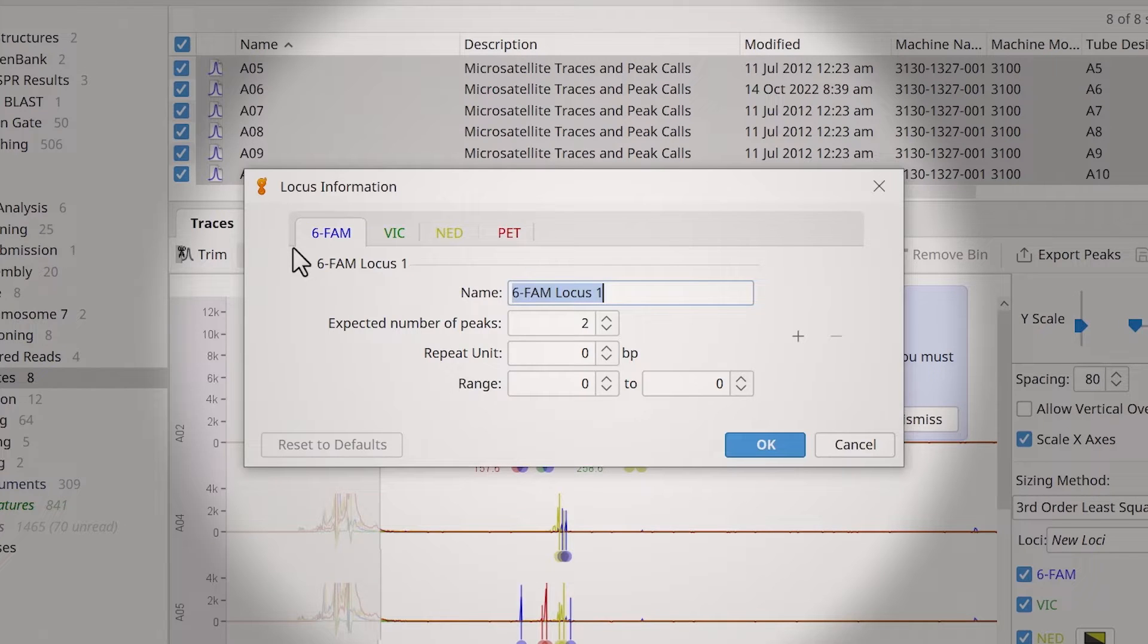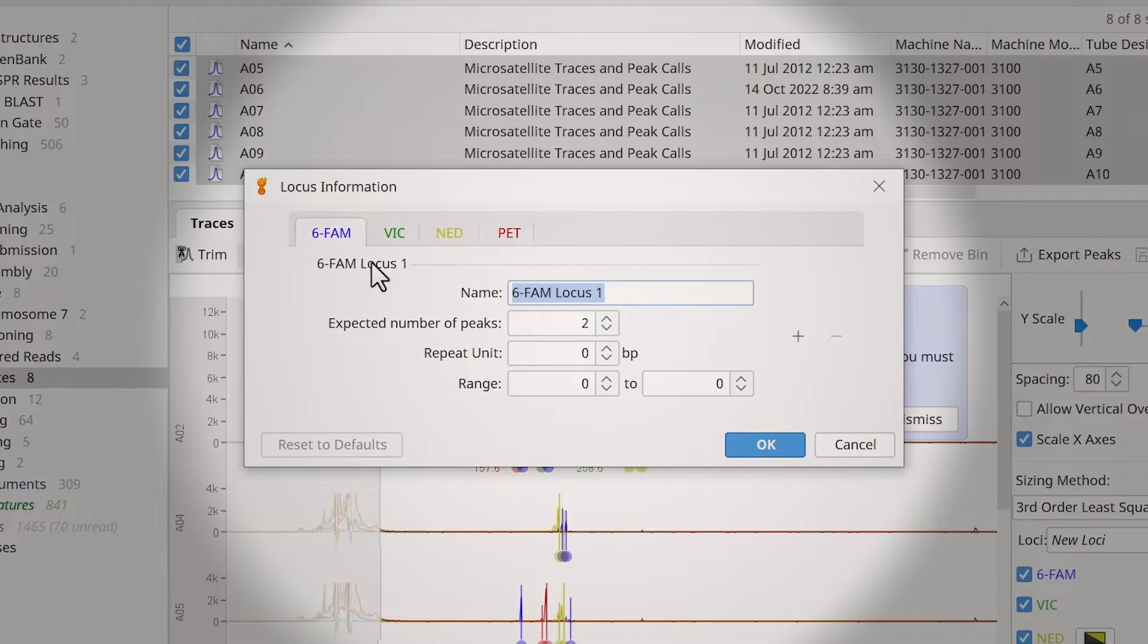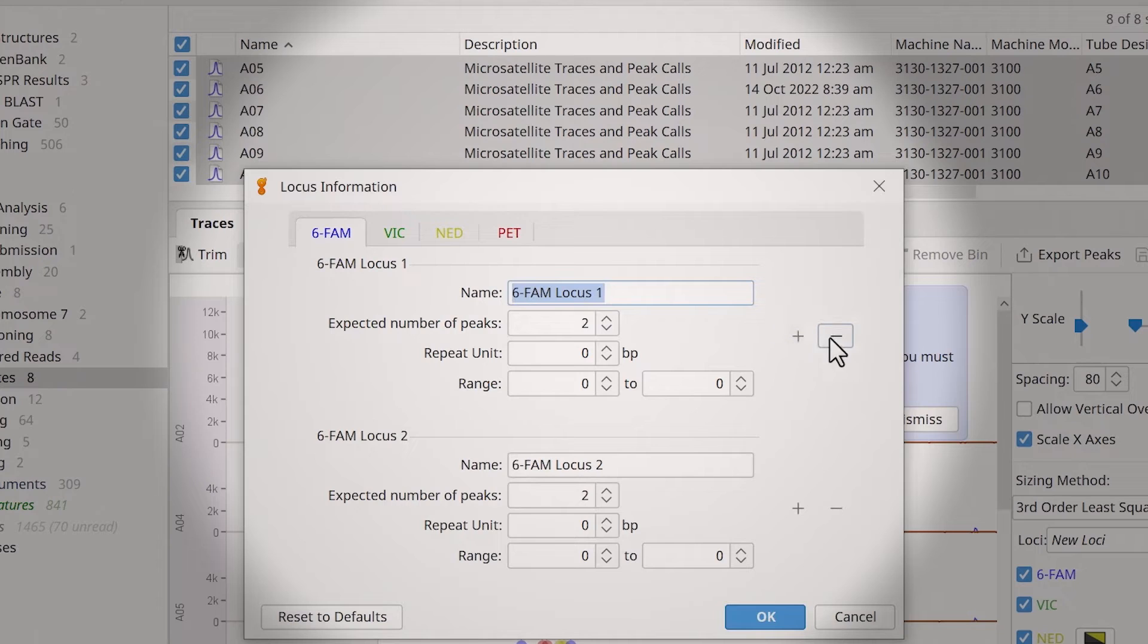Adjust these settings based on the known characteristics of your loci of interest. To add or remove additional loci, use the plus and minus buttons.